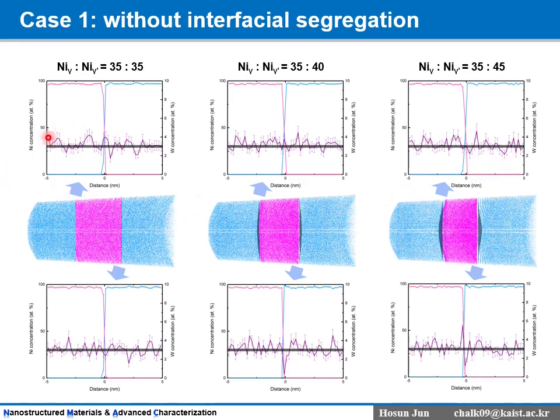In the upper interface, no clear concentration artifacts were observed regardless of the evaporation field difference studied here. And in the lower interface, some sharp concentration fluctuation was observed when the field difference was larger, but in this result, no wide and high concentration peaks as in the experimental data were observed.